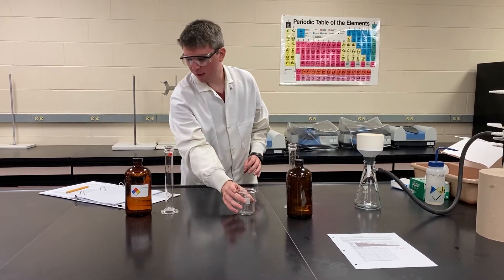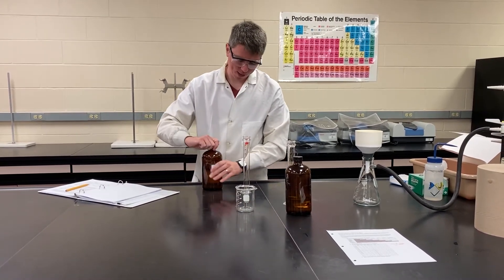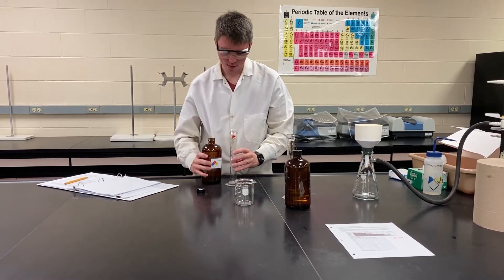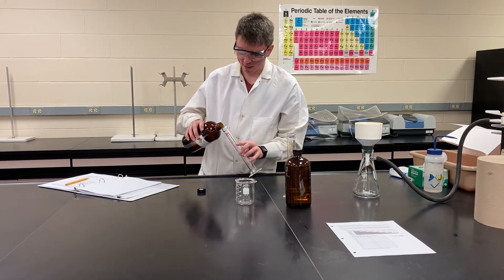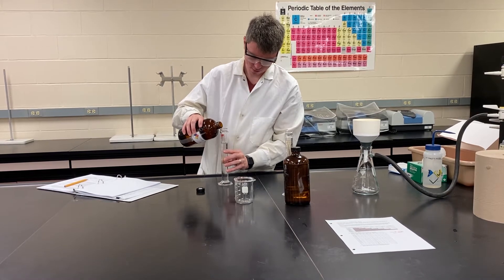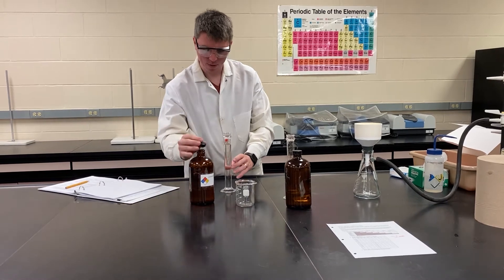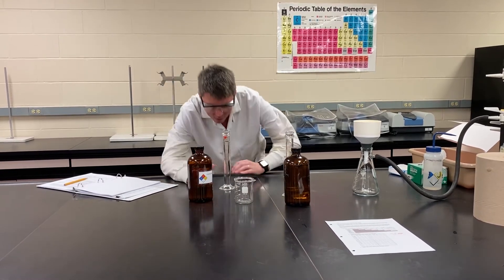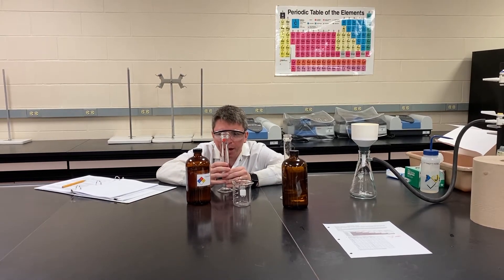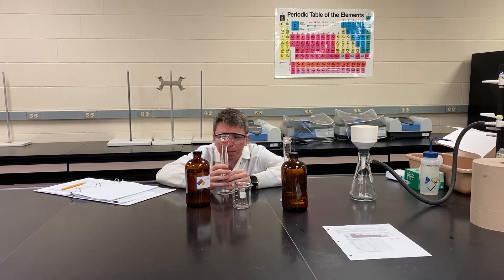Now we're going to do the same thing, except we need about 100 milliliters of silver nitrate. Because this is a 100 milliliter graduated cylinder, be careful that you don't overfill it — you might have a little less than 100 milliliters. You don't want to overfill your graduated cylinder. That's about 98.3 mL.